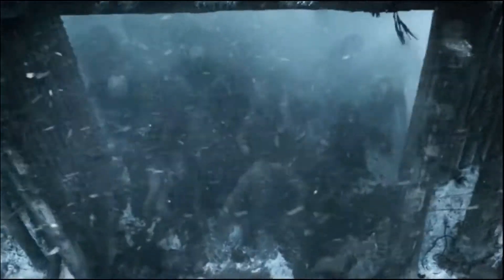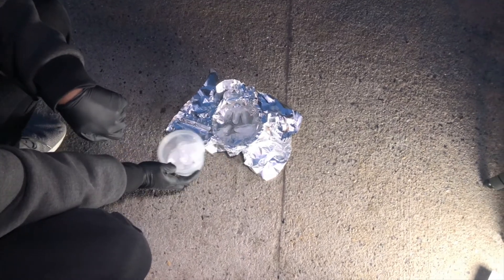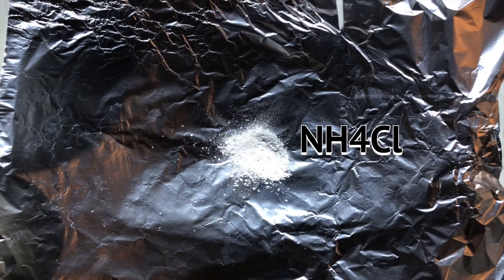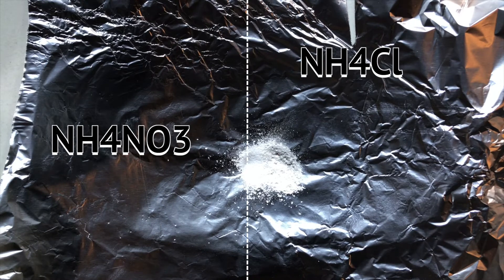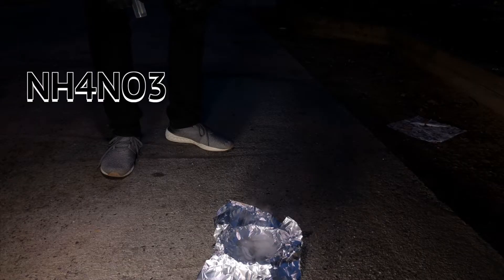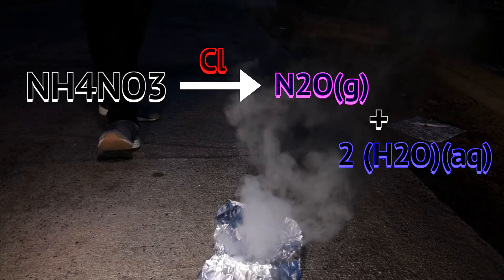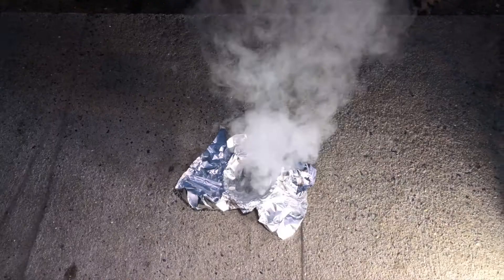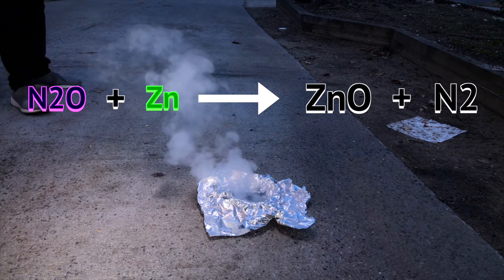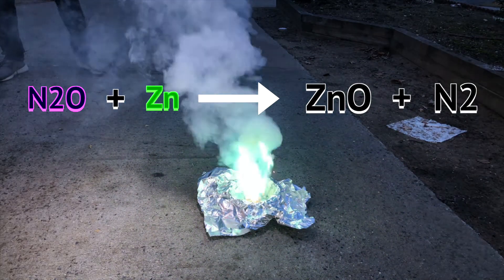As scientists, we don't always have all the answers, however we should inquire. So this is what I think is happening in this reaction. In case there's a zombie apocalypse or you're out in the middle of nowhere, knowing this may save your life. As the ice melts, it phase changes from solid ice to liquid H2O. The liquid water then mixes itself with the three powders. The two powders — ammonium chloride and ammonium nitrate — ionize and decompose, causing chloride ions in the ammonium chloride to speed up the decomposition of ammonium nitrate. Ammonium nitrate decomposes, which yields nitrous oxide and more water. This autocatalytic effect speeds up the production of nitrous oxide, which simultaneously reacts with the zinc powder to produce zinc oxide and nitrogen gas. The bright green flame is the result of zinc ionizing.